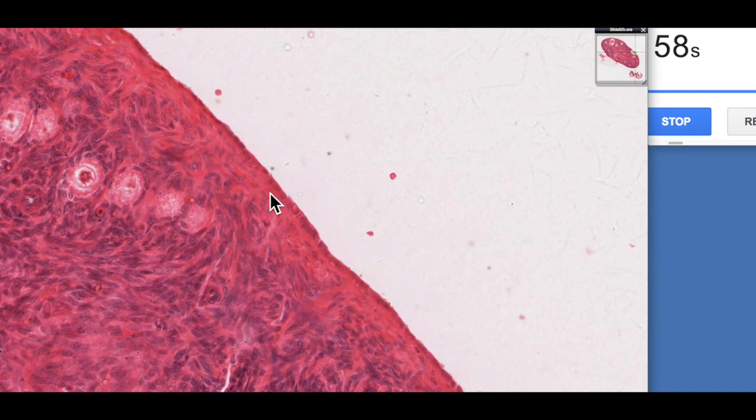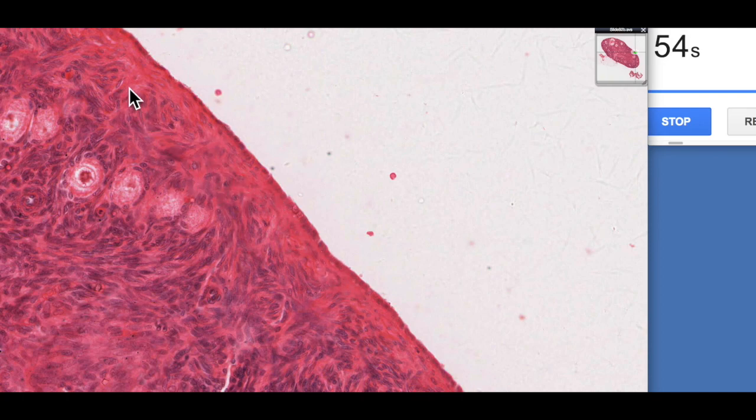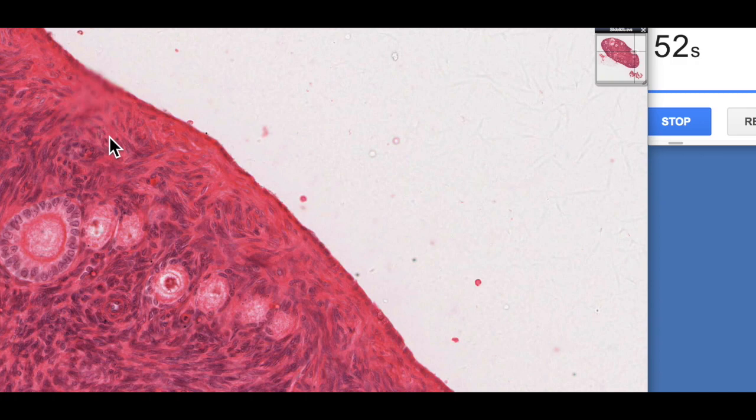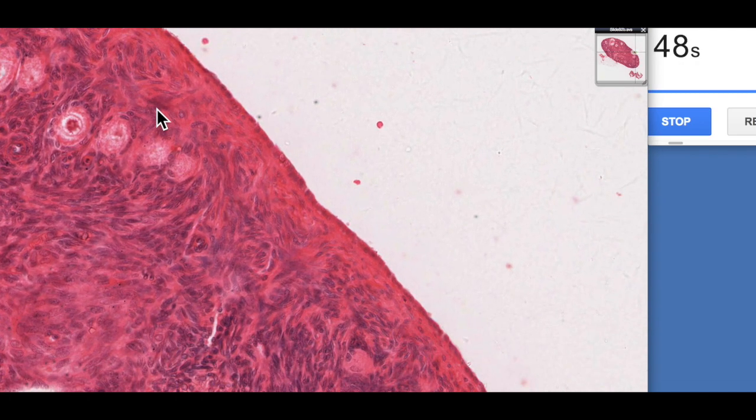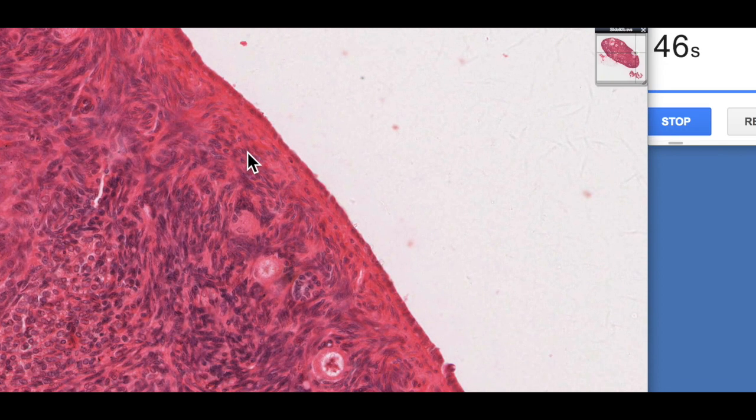There would be a basement membrane sitting beneath there, and then we've got a dense irregular connective tissue layer here, which is referred to as the tunica albuginea. This is a term which you may have come across if you've looked at the histology of the testis. The testis has a tunica albuginea. It just means a white layer because of its dense connective tissue.